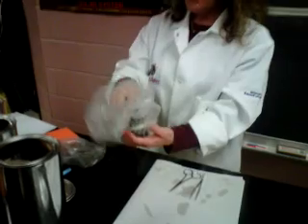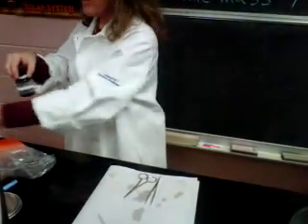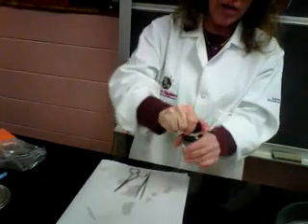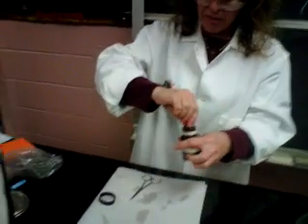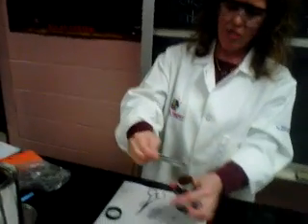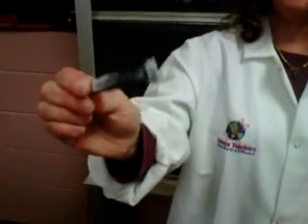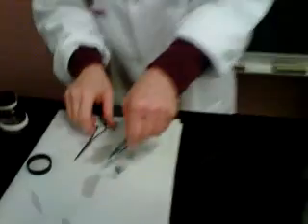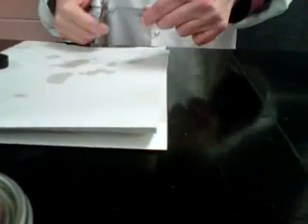So potassium, right? They all have one electron in their outer shell. They have different numbers of electrons, but they all have only one in the outer shell. Okay, so what do we notice about this one in comparison to the other one? It looks dark, like tarnished. Now this one, I can cut this, but it tarnishes so quickly.